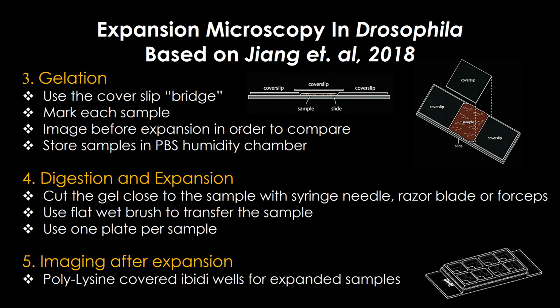So this first part, steps 1, 2, 3: the staining, of course, takes time, but then the gelation step and the imaging can be done in one day. Next day, after you image your sample, you can start with digestion and expansion.